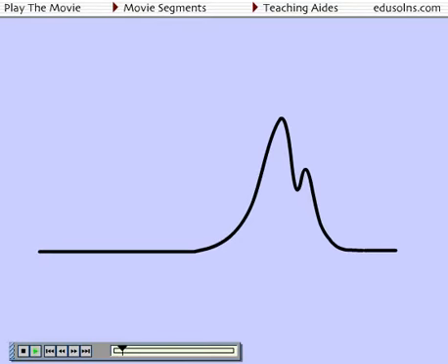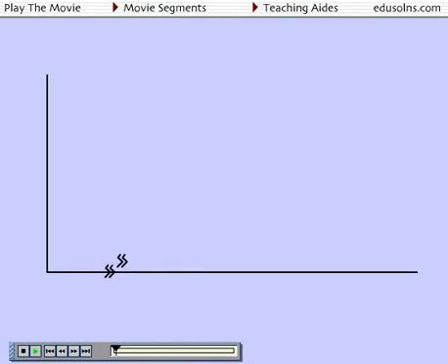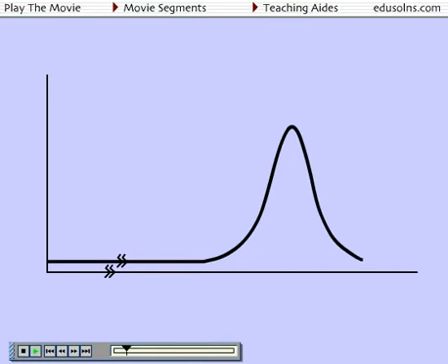For example, it is not always possible to completely separate all compounds in an HPLC system. If the peak of interest is a shoulder peak, even after the system has been optimized, determination of the peak area will be very difficult using the 2 previous data processing tools. Computer integration systems, such as the PeakNet software that comes with the Dionex DX500 system, allow more accurate peak area calculations for these problematic separations. Every brand of data processing software works differently, so it is not worthwhile to go into too much detail here. You should consult your user's manual for the specific details of your system. There are a few basic approaches used to process peak areas.